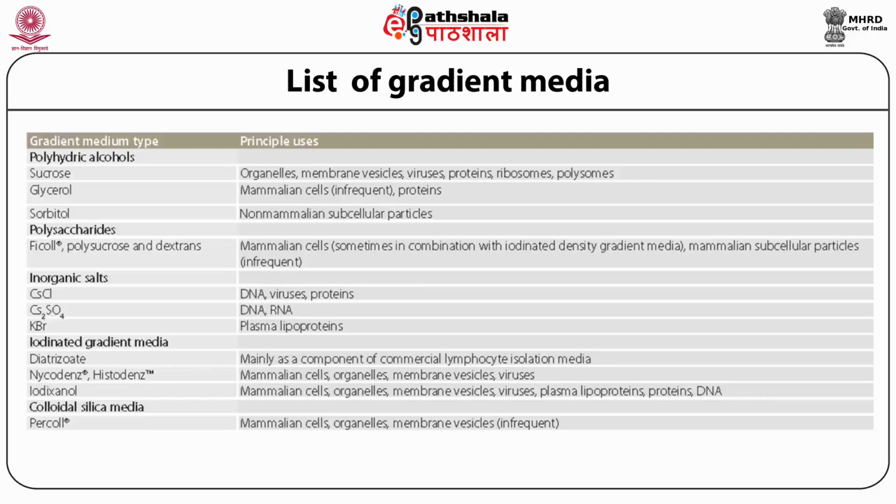And the colloidal silica media are also used for gradient preparation, like Percoll, used for the separation of mammalian cell organelles and membrane vesicles. And these are the media used for the preparation of the density gradient for the separation of biological molecules.